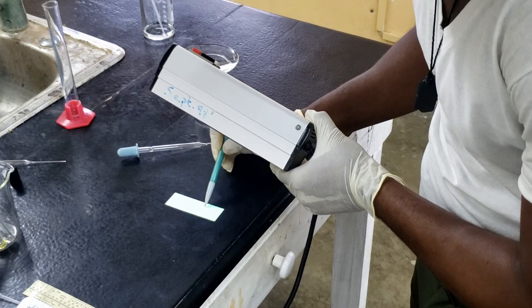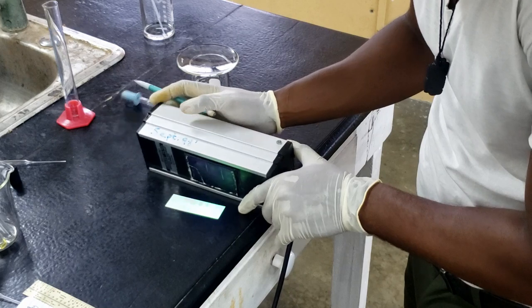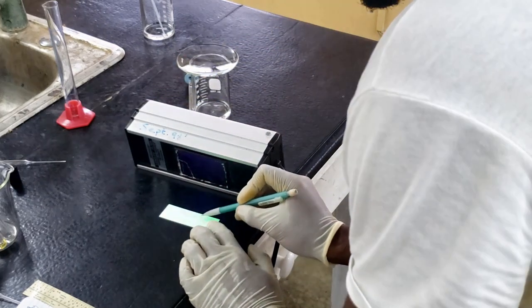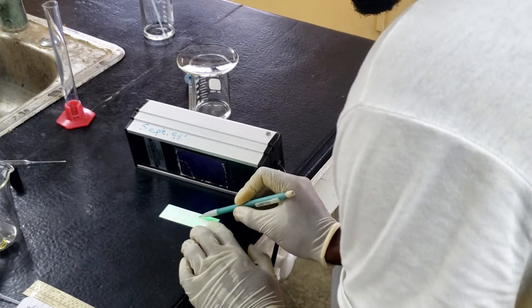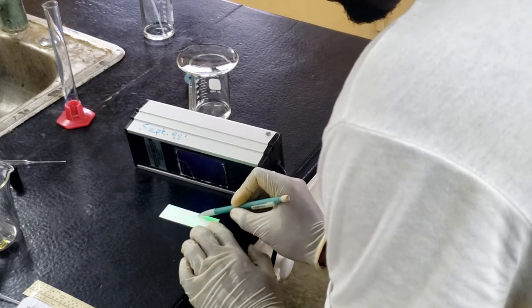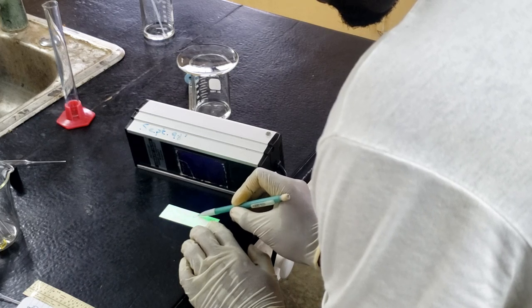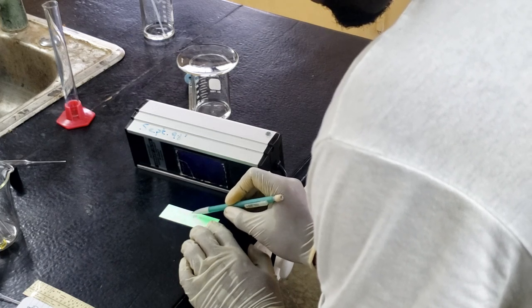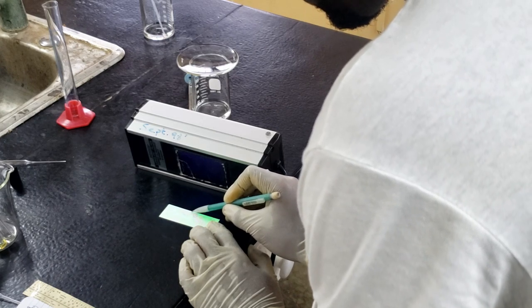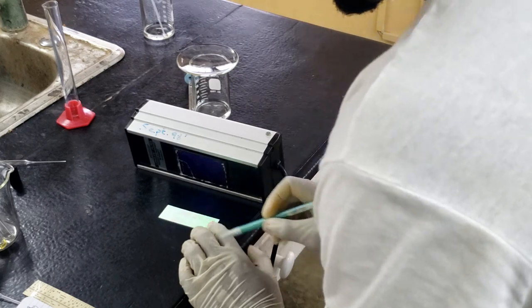Our first spot, for the O, it's just about here. Here's another dark band. Here, a larger band. And another band here.